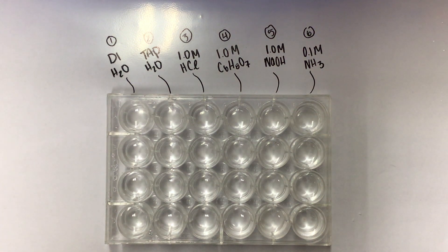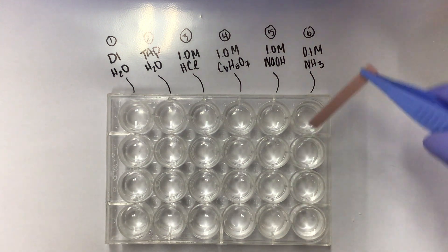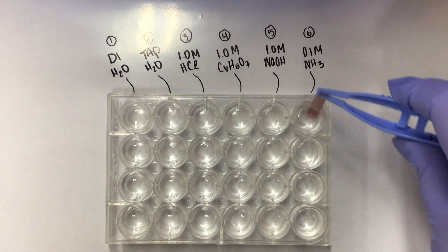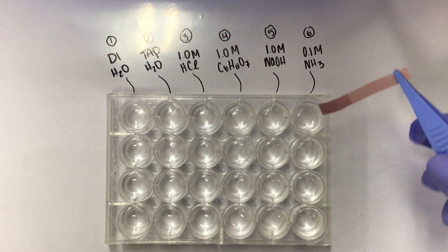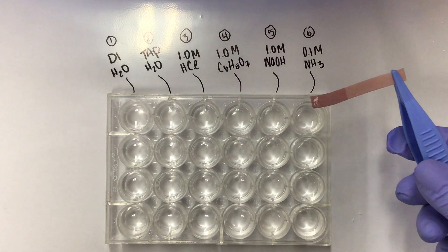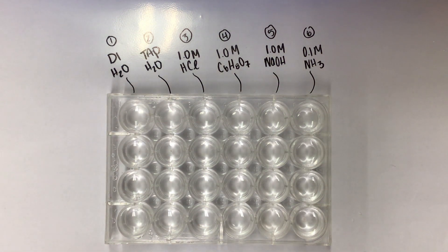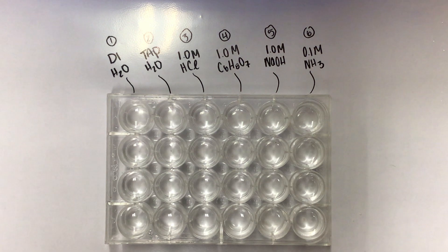Blue stays blue. Blue stays blue. Last one. Blue stays blue. That's all for our litmus paper test.